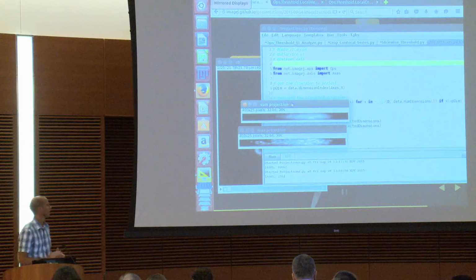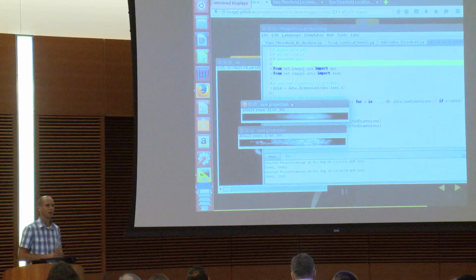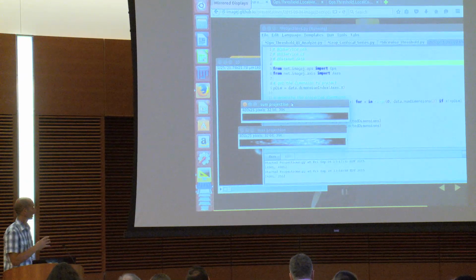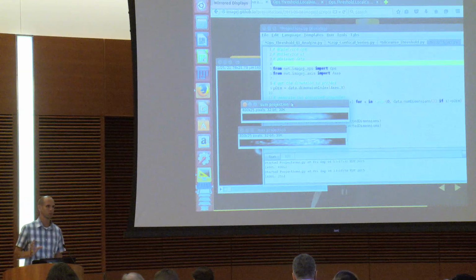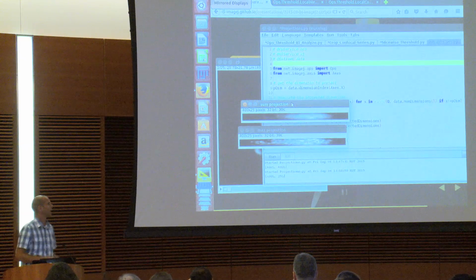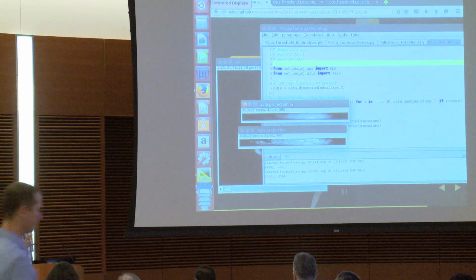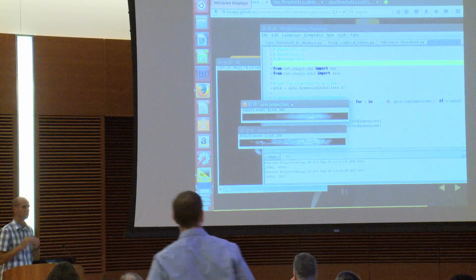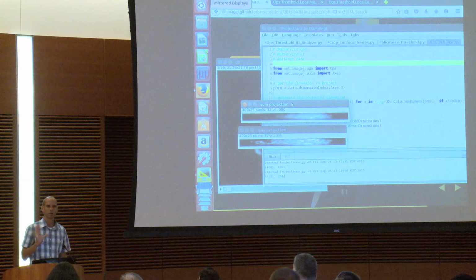So another thing I'll say about this script, I realize that there's a lot of steps to just get a projection. This is something that will change in the near future. We were already talking about this a little bit. You really should just be able to say ops.project and pass in your data set and your dimension, and boom, you get it right away in one line of code. And that's going to happen.